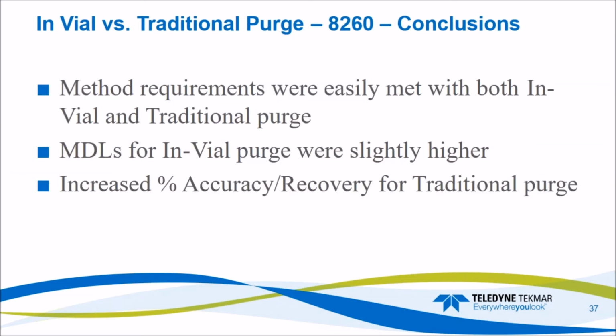The method requirements were easily met for both the In-Vial and the traditional purge. We did see our MDLs in our In-Vial purge being slightly higher and an increased recovery or percent accuracy for our traditional purge, but both passed our 8260 EPA method and looked great.